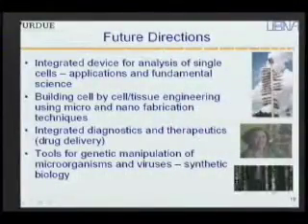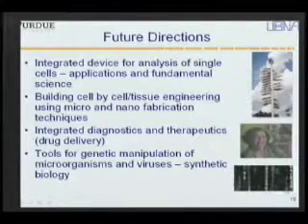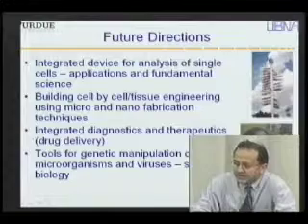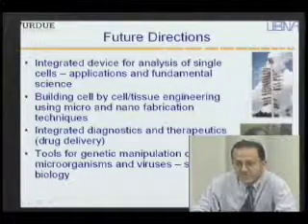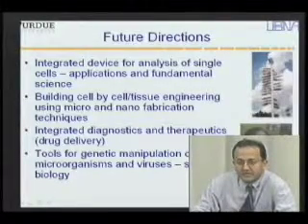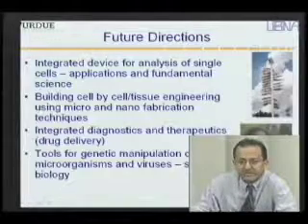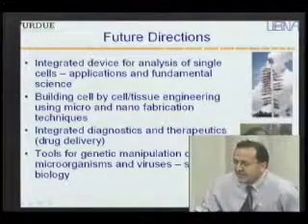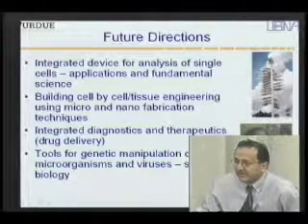So integrated devices for analysis of single cells. This can be used for many applications and also for some fundamental science for studying the functions of single cell, and being able to probe single cells would be very useful for basic biology.